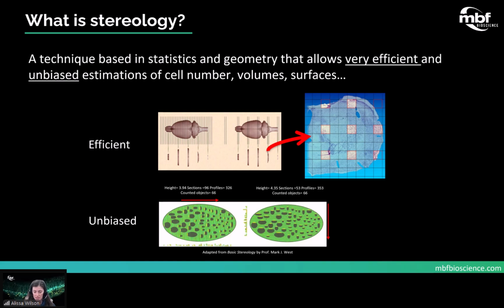And in this case, the grid spacing and counting frame would be part of the setup for that whole region workflow and apply to this whole region. And therefore, the counting would still be completed on systematically and randomly sampled image stacks. By doing the whole region, it does give you the flexibility to set up multiple SRS acquires on one image set.